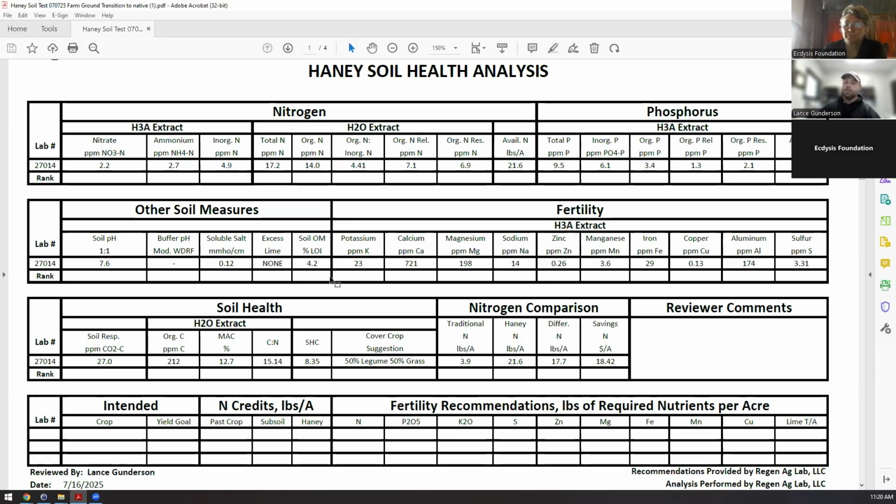So percent MAC is a very valuable number. Again, just to step back, I start with the soil health score. Then I look at respiration. If my respiration is 140 and you say, well, what should it be? Well, that's dependent on your carbon availability. So the balance between availability, so percent MAC is a more important number than just respiration by itself or carbon by itself.